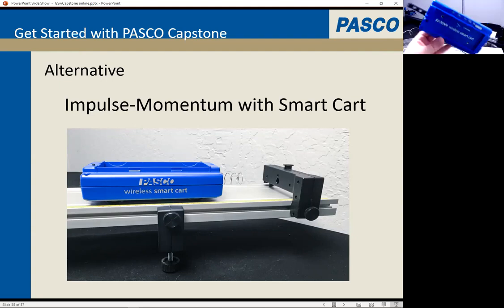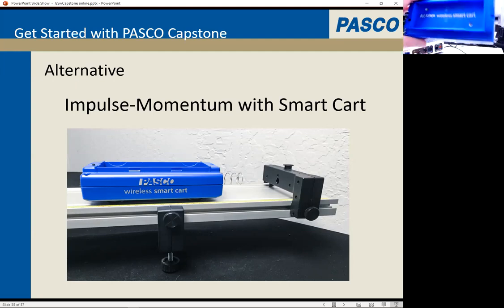As technology progresses, you can do neater and neater things at lower and lower costs. So I've intentionally showed you how to do it across generations here, but there is a way to do it with even our wireless sensors, with just this single wireless sensor.